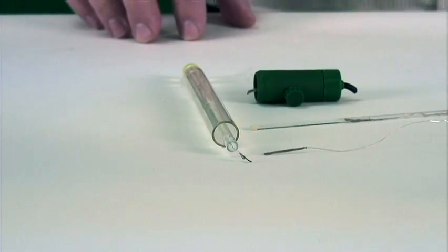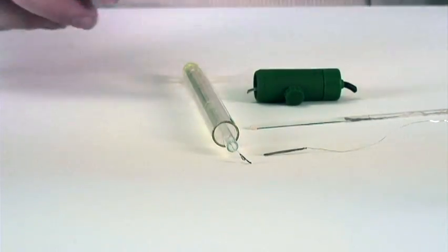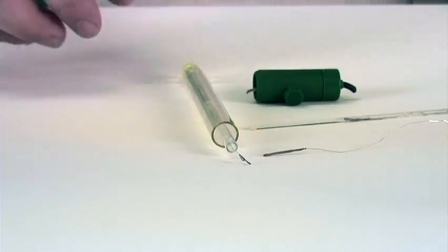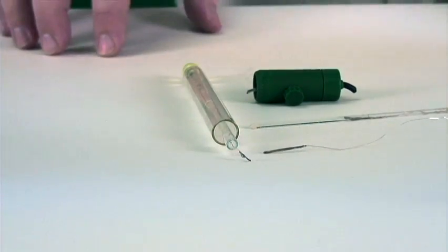Here we have the body of an electrode. Inside the body of the electrode we have the inner sensing tube. Inside the inner sensing tube we have the sensing wire. Outside the inner sensing tube we have the reference chamber.